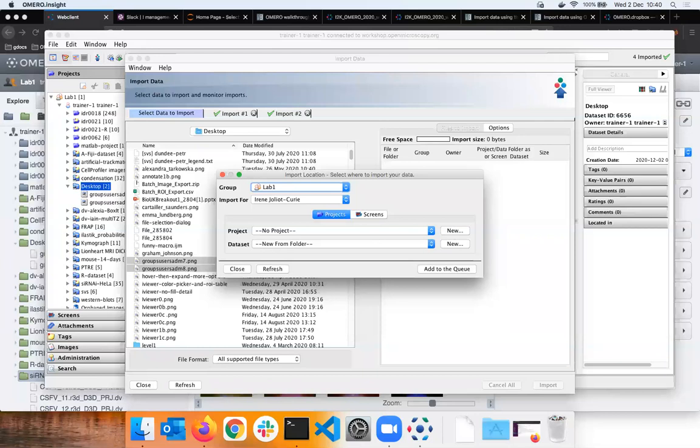If you have more than 2 layers, it will only pick for the data set. The data set is just a layer, the container with the images, and the layer above. If you want to start mimicking and allowing users to do that, you will probably have to make each folder a tag, and then people search via that mechanism. That is a possibility, but it's not an infinite hierarchy in terms of OMERO.